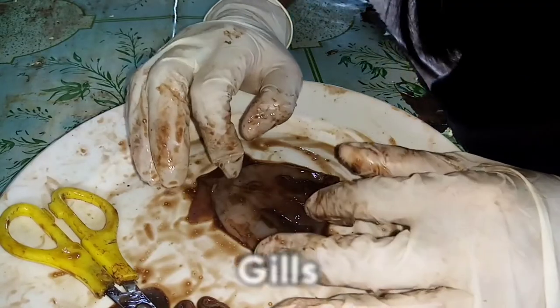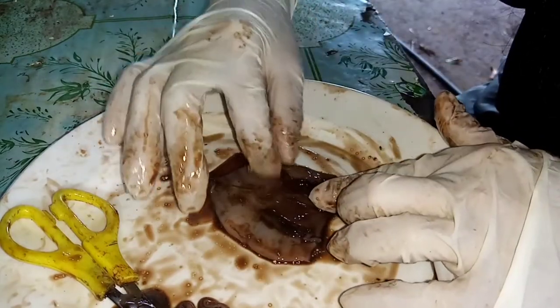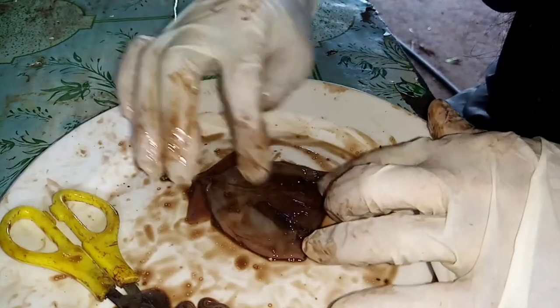Like the fish, squid also has gills. So this is the gills of the squid. As you can see, this one, the gills.